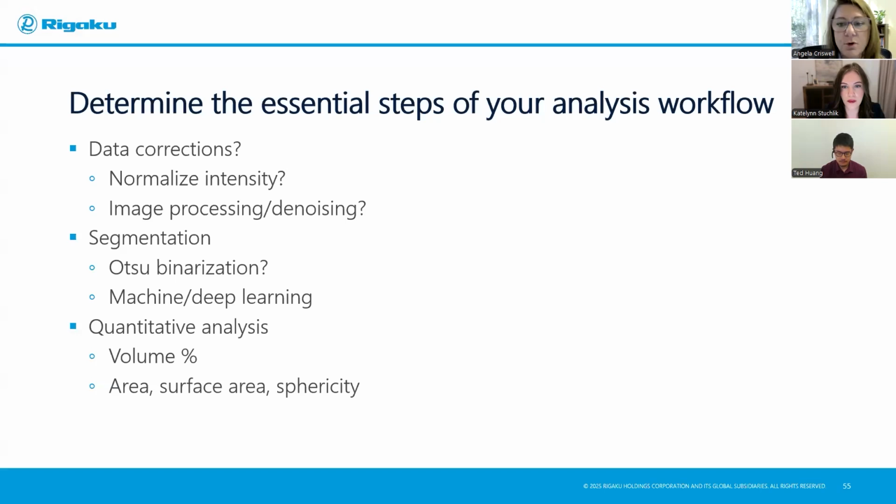And most important, what quantitative questions are you going to ask? Are you interested in volume percentages, area, surface area, sphericity of your pores, for example? So what steps are essential and what do you need to calculate? And also, are you going to perform any simulations? Many programs have simulation tools that you may want to use, and consider using those as well. And whether you're going to perform simulations for every sample or just a subset of selected samples.